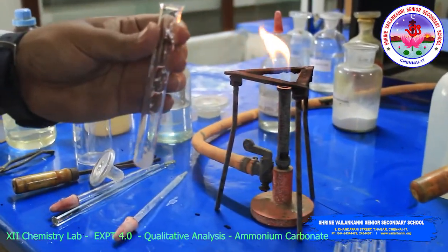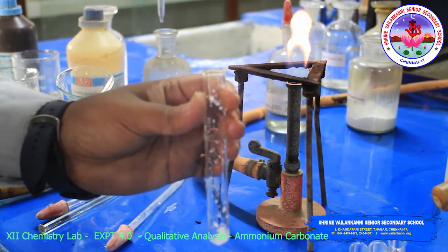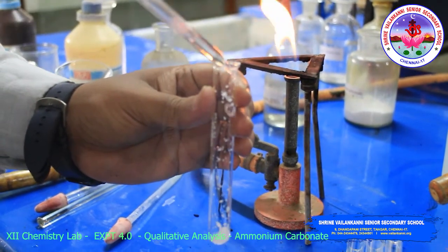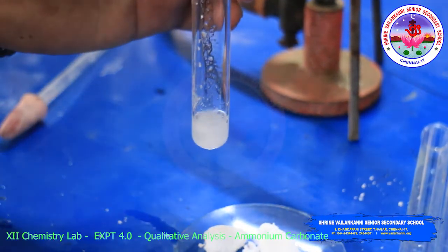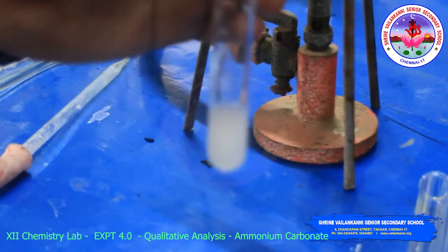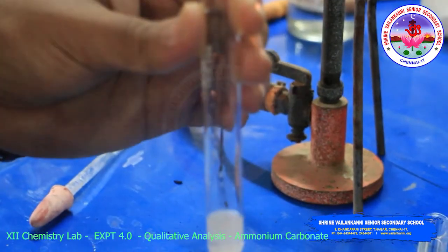Take the substance and add dilute HCl. Brisk effervescence comes. So this indicates the presence of carbonate.